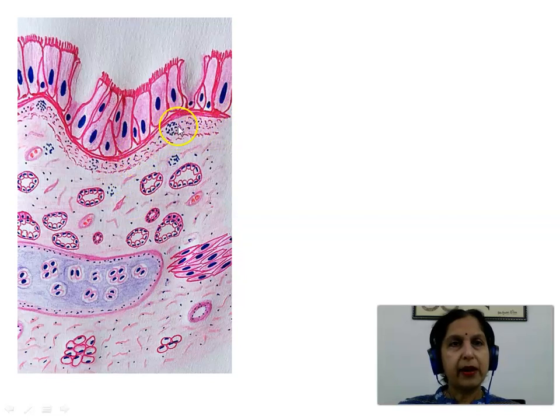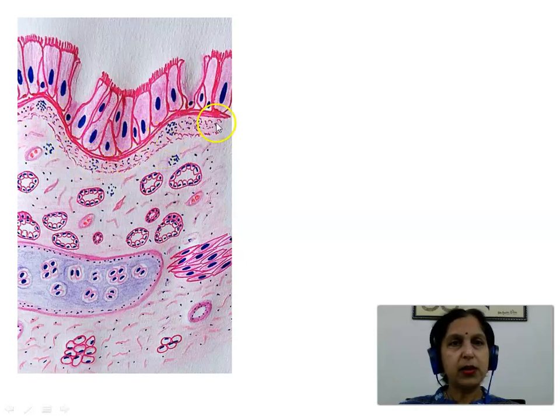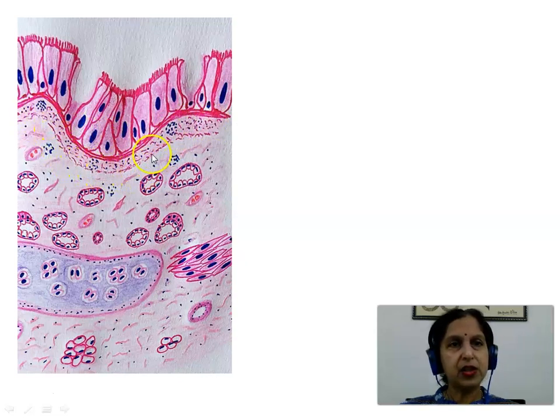In the same picture we see lymphatic aggregations, lymphatic follicles, and lymphatics with numerous elastic fibers. We also see the elastic membrane which is formed at the junction of the lamina propria with the submucosa.